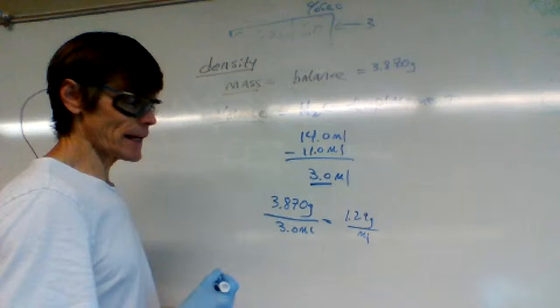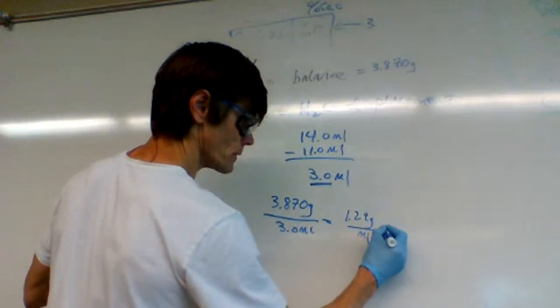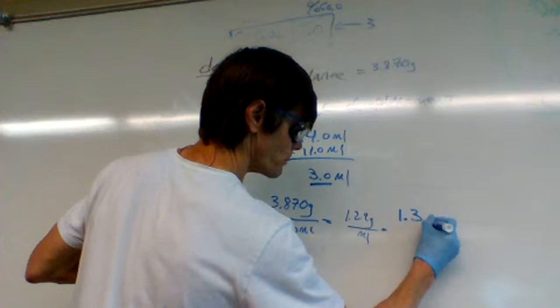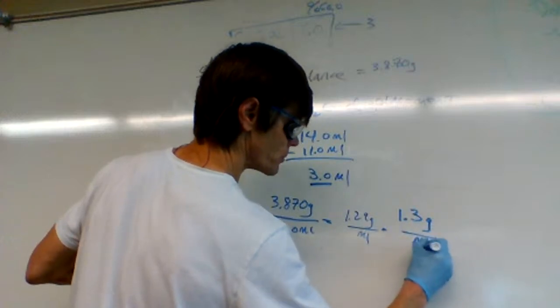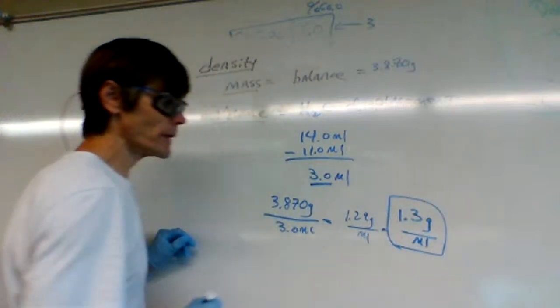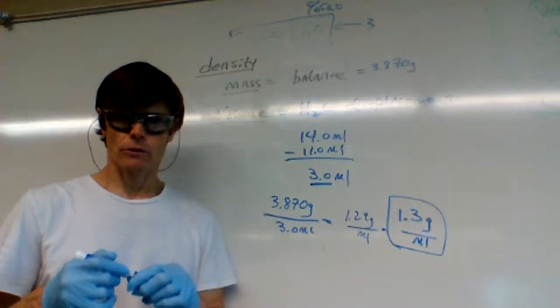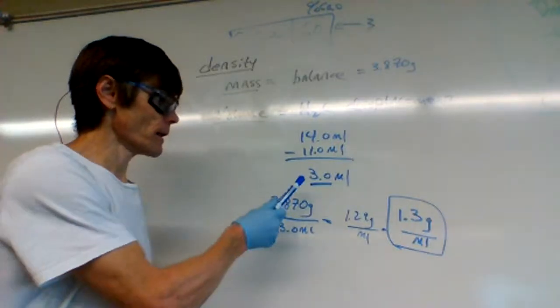And if I'm limiting it to two digits, 1.3 grams per milliliter.